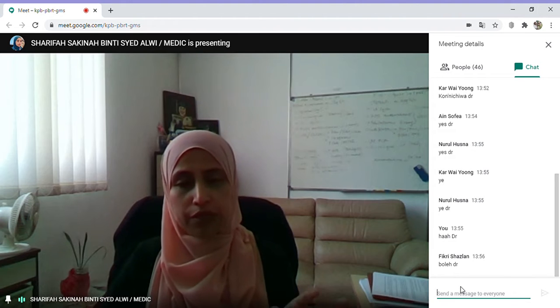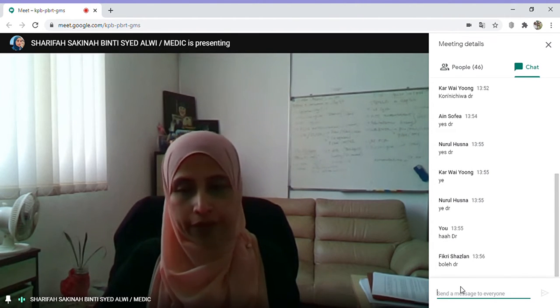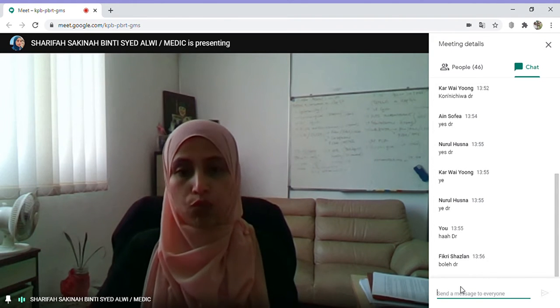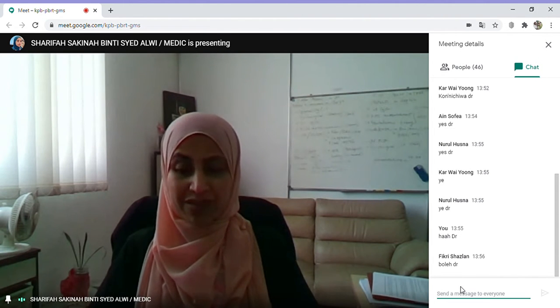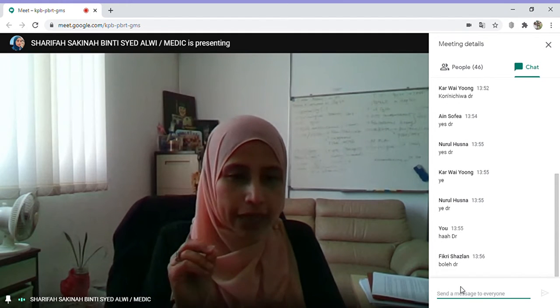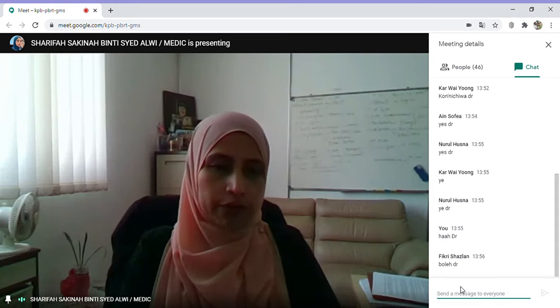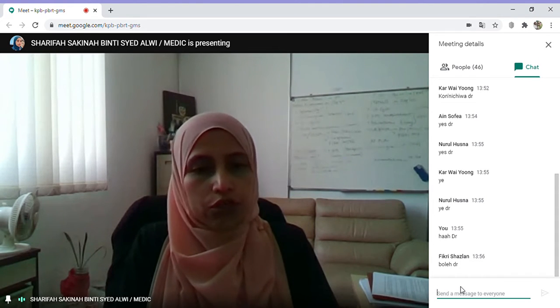You have to make sure the amount of cells is not more than roughly a hundred, because if it's more than that, you tend to make mistakes, because of course your eyes cannot work for a long period of time, especially when you really focus on the type of the cells or the shape of the cell. So it's going to be very difficult. All right, so why do we need this technology? Look here.